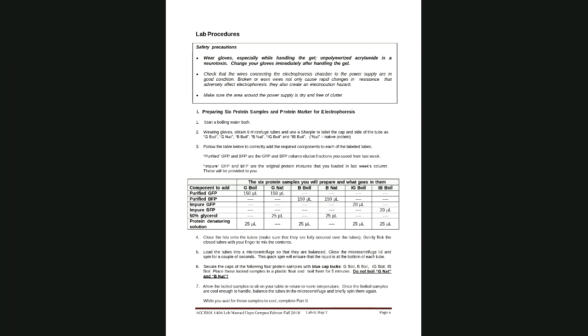This is the first page of the lab procedures. If you look up here, there's a table here. You've got to read this information here, and it gives you some of the information, because in the post-lab, it's going to ask you questions having to do with what does GBOIL stand for? What does GNAT stand for? What does IGBOIL stand for?